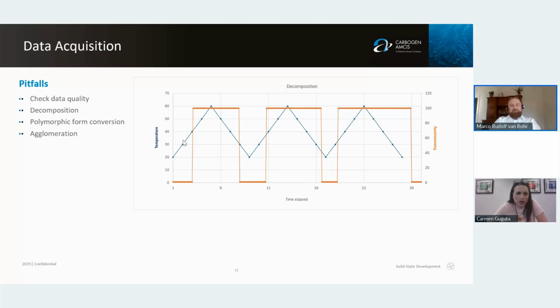Absolutely right. When you have the Arrhenius type plots, do you convert to molar units or weight percentage? No, that has a reason. If you go to molar units and you change your composition, it is very tricky.